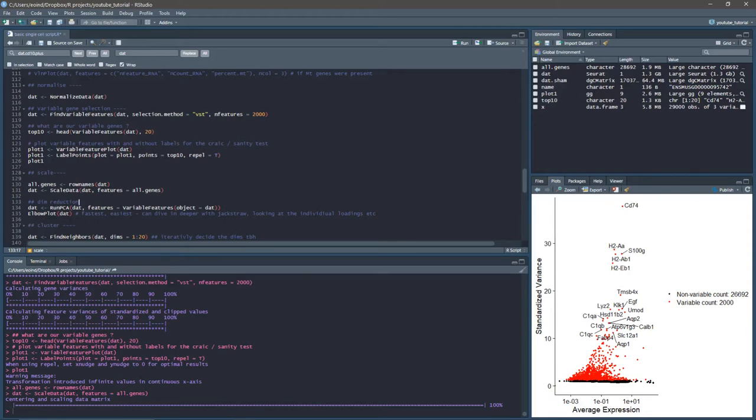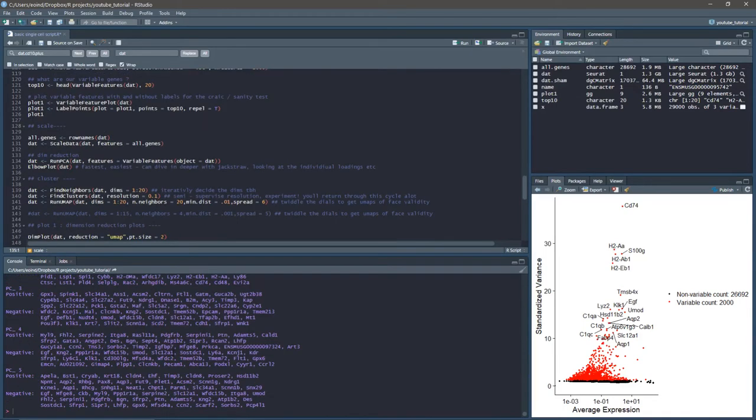Next we're going to run principal component analysis on our highly variable genes first, and then store them inside the object. We're going to use these to do further dimensionality reduction. You could do a tSNE or UMAP using them, which tends to produce much cleaner results than doing the UMAP on all of the genes, where everything is really standard.